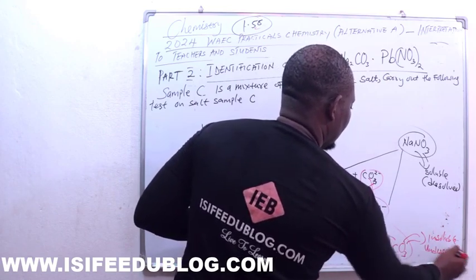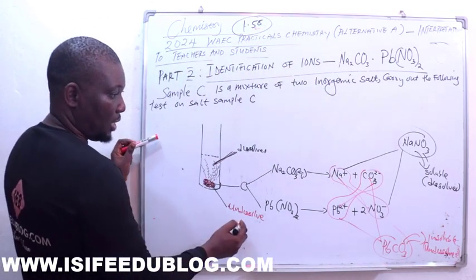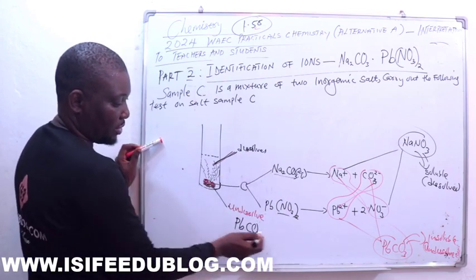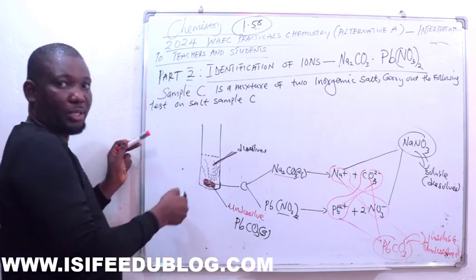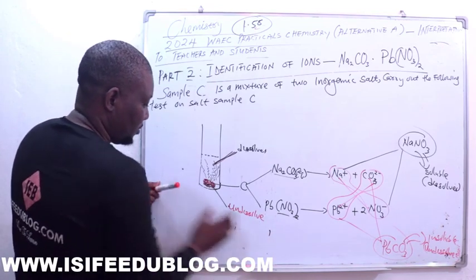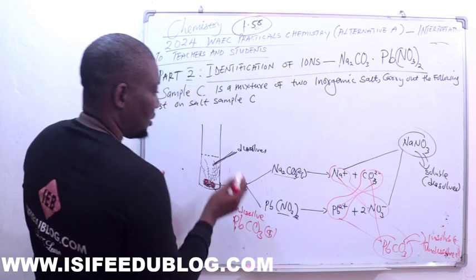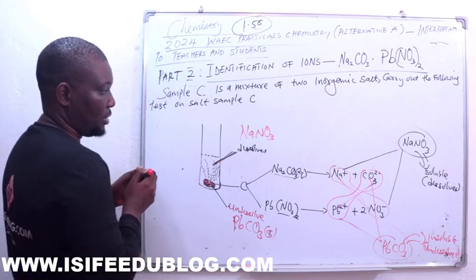So this undissolved part is actually PbCO3. Something we started this week is now turning out this week. We use S, meaning that it is solid, to separate this. So this part that is undissolved, I am going to label as S.